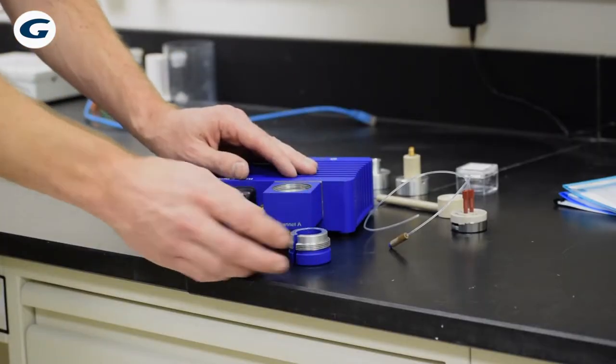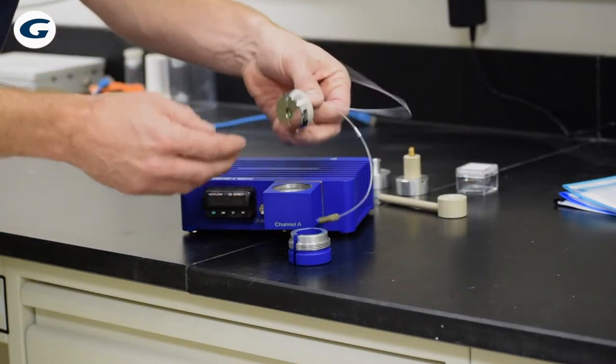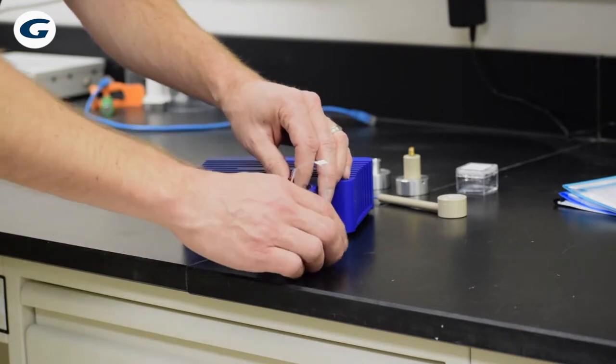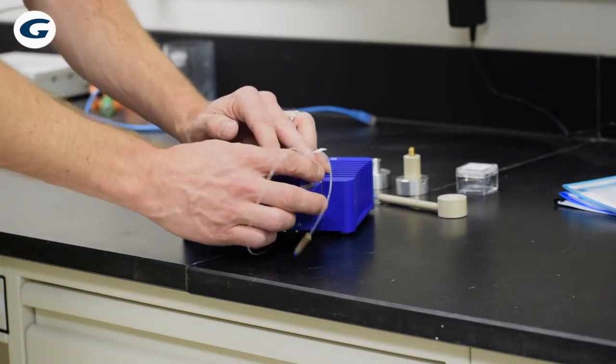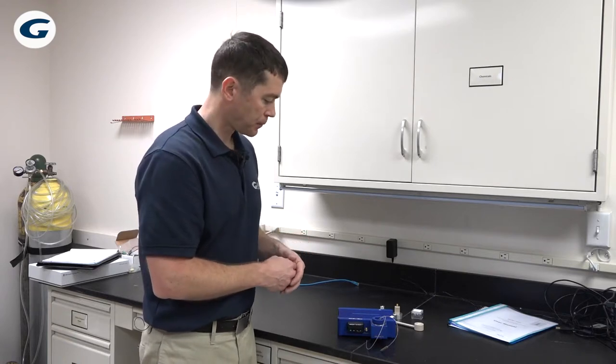Simply unscrew this head. Then you take your flow cell module, align this notch with the pin that's inside, and you take your head, put it back on, and screw it down. And now you're ready to make your measurements using the biosense software.